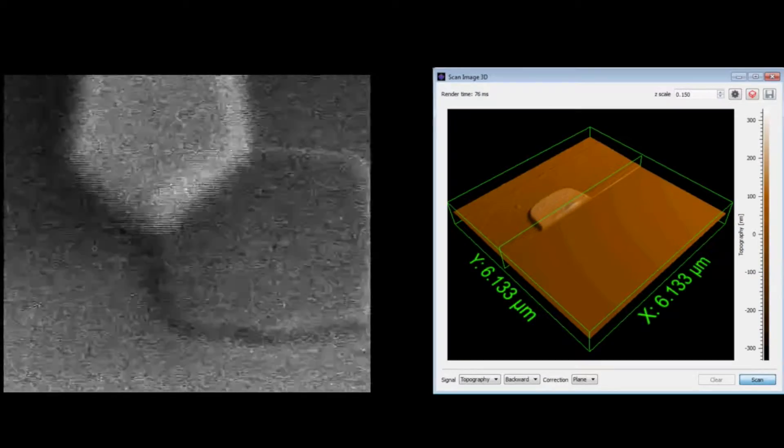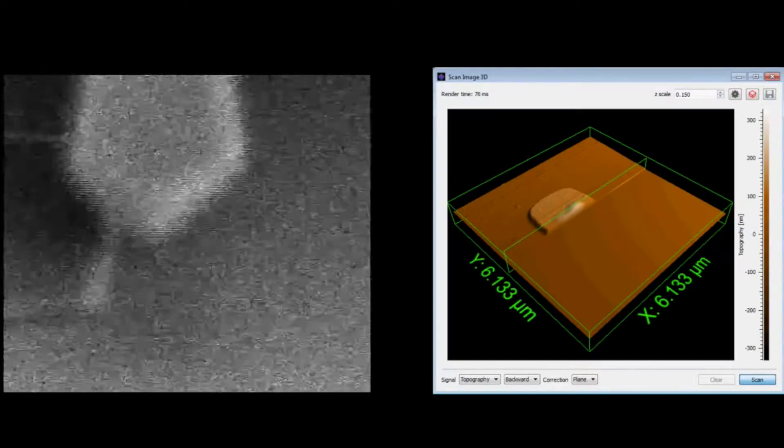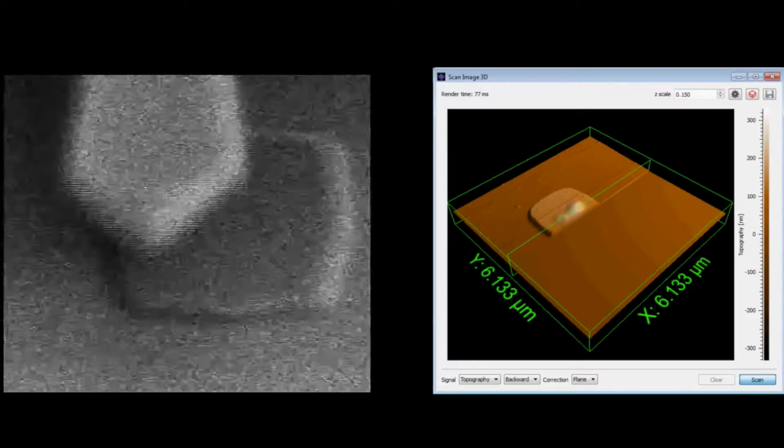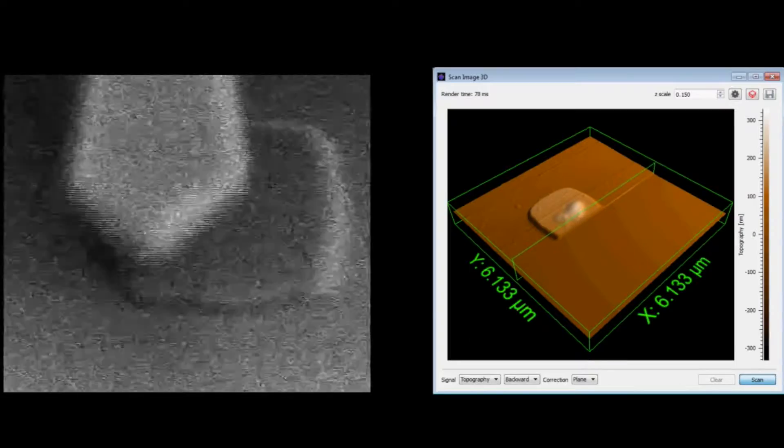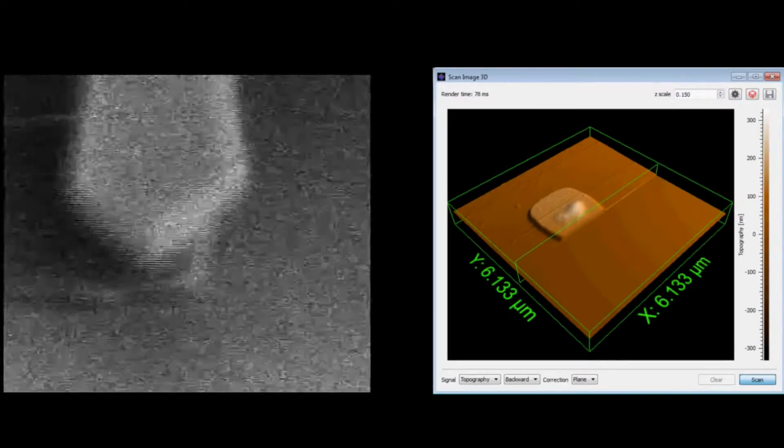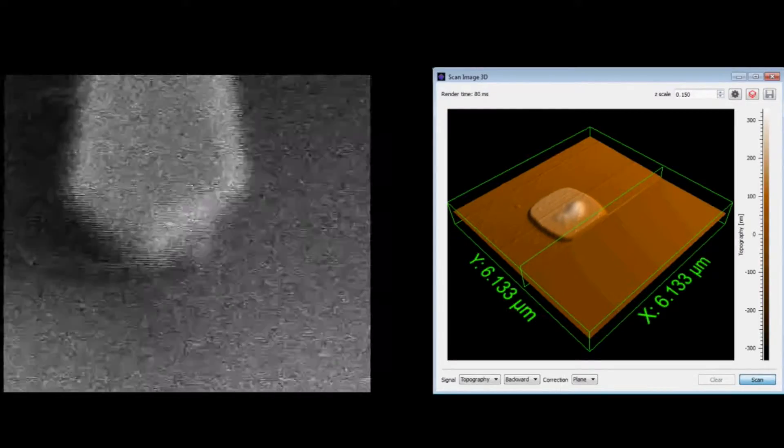After navigating to the point of interest using tip navigation we start the scan procedure. During the scan we can select a smaller area for the scanning window within the 60 by 60 micrometer range. The overlap of both images gives us exact information about the topology, the heights and the depths of the observed features.